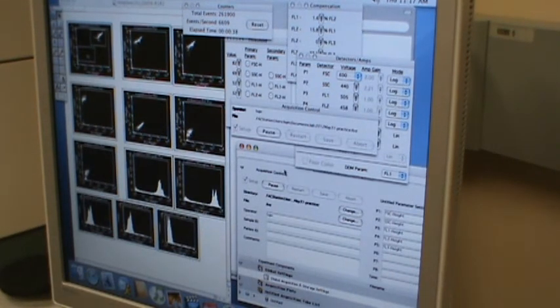So I'm going to pause this, uncheck this and just store this data. That looks like a good signal. If there are so many cells, it stops immediately. It actually goes to 25,000.